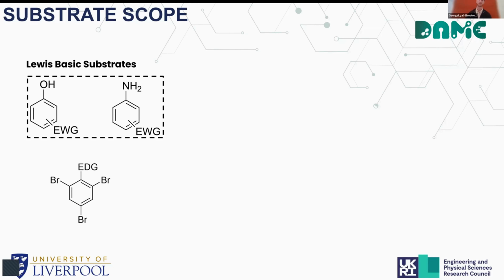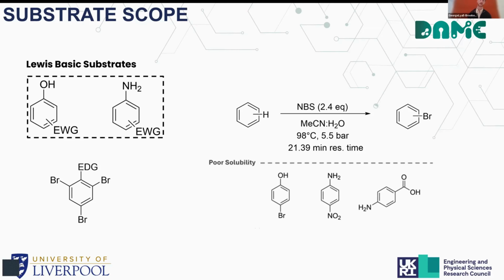And to investigate this, we carried out some initial screening on some hydroxy and amine containing species, using the optimized conditions that we'd previously developed for the heat activated procedure. But unfortunately, we observed poor solubility in a lot of these species, primarily due to a lot of organic compounds being particularly insoluble in the water.